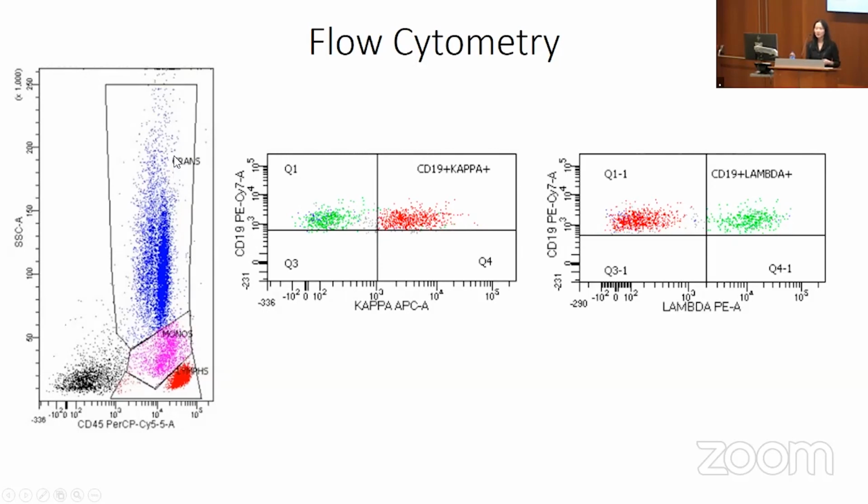You have granulocytes. As you know from the morphology of the neutrophils, they're highly complex. They've got granules in them. So they are very high complexity when they are mature and low complexity when they're immature. And so you've got monocytes here that are in between.